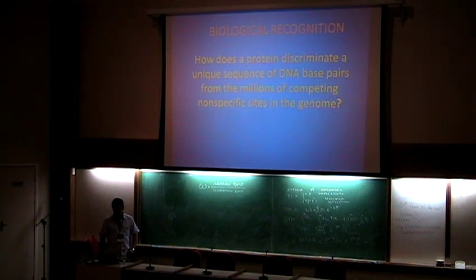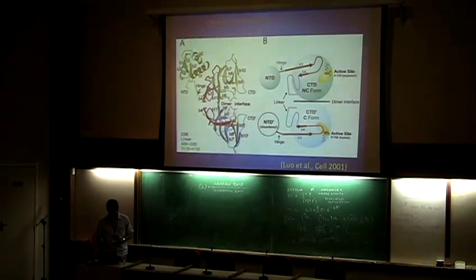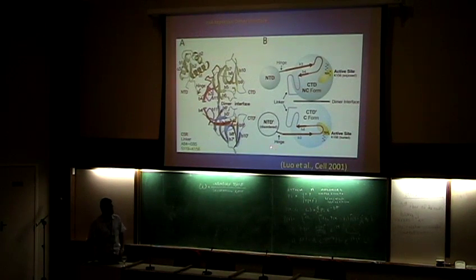In this way, we can do a lot of reactions. For example, others have used it quite a lot as a tool to measure the free energy coupling between folding or oligomerization and ligand binding, or DNA binding, or even RNA binding. There were a couple of papers recently on RNA binding. But this is a system we have worked a lot with, the Lex A repressor, that is a dimer. We went to the literature and picked this protein that at the time was in the books as a monomer. So let's work with the monomer. In fact, it's a dimer, shown here.